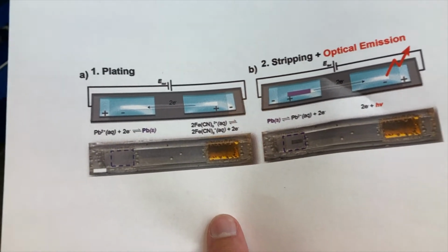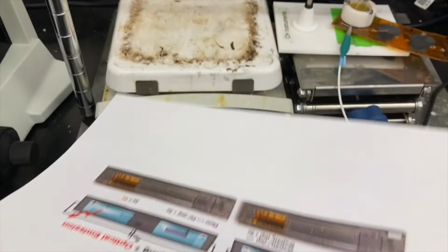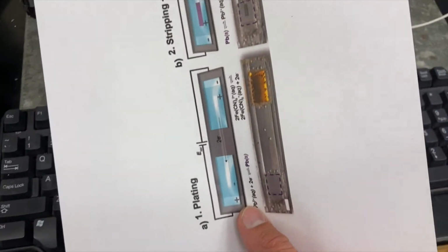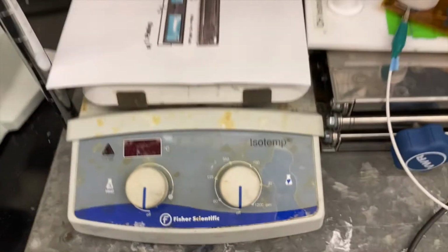we want to make the wax sink through the paper. So we're over here at the hot plate. This is a little bit bigger than you'd want to do if you were making, for example, a sensor or some sort of device that would have fluid on it, because you wouldn't be able to melt the entire thing. But for demonstration purposes, we're just going to only melt part of it.